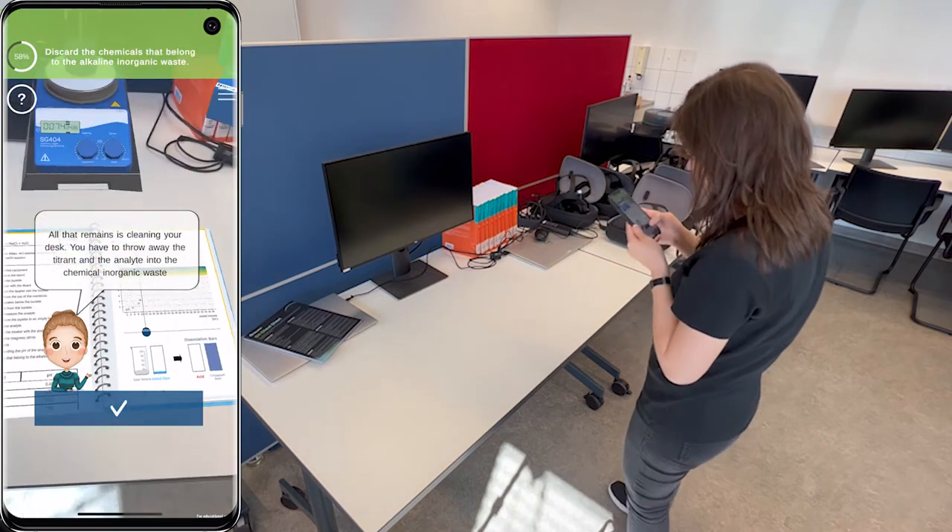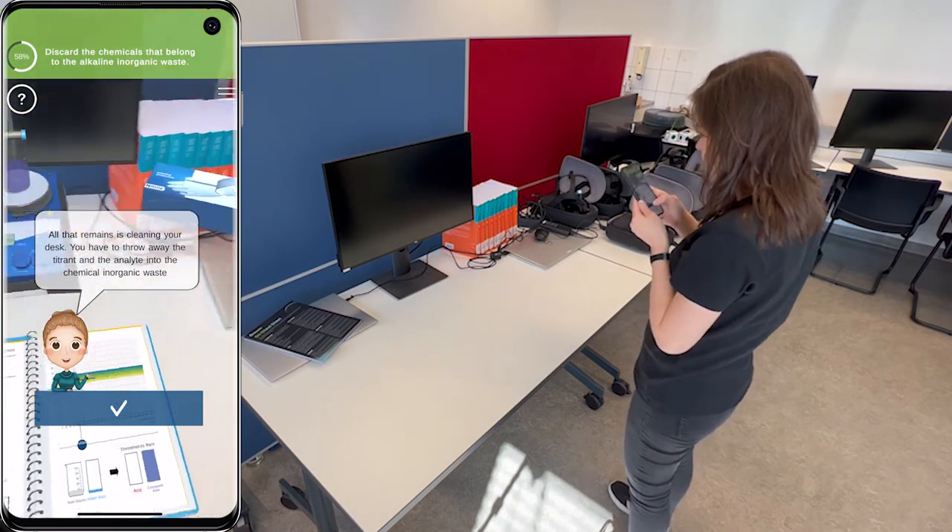All that remains is cleaning your desk. You have to throw away the titrant and the analyte into the chemical and organic waste.